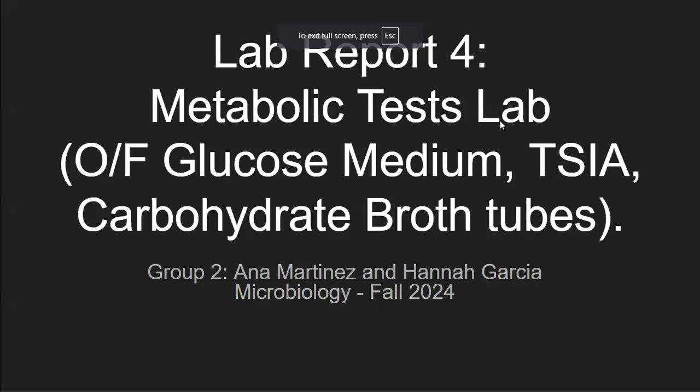Howdy, this is lab report 4, Metabolic Test Lab. OF glucose medium, TSIA, carbohydrate broth tubes. Group 2, Ana Martinez and Hannah Garcia, Microbiology, Fall 2024.